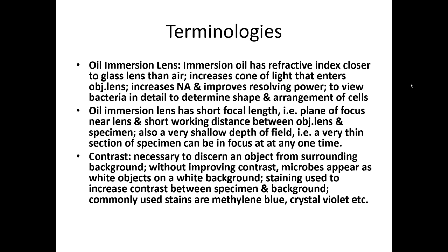Okay. Today we are going to study different types of light microscope. In your syllabus, I have shown you in the last two classes, in Unit 13 you have a topic, rDNA technology and related things. In that, this will come in part F or G, microscopy. In microscopy, you have to study the light microscope, magnification power, microscopes used to observe live microorganisms, and the electron microscope, which is used to visualize internal cell structures and viruses. Then the staining techniques used in electron microscopy. All of this comes in your syllabus. So today we will start with different types of light microscope.